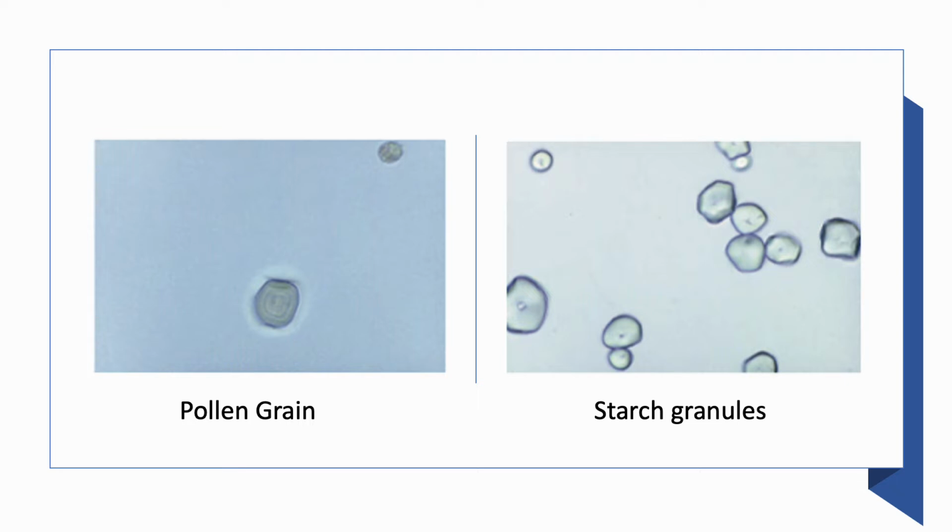So what we can do is use polarizing microscopy to be able to identify a Maltese cross from an actual fat droplet, or a red blood cell can be differentiated from these starch granules by considering other urinalysis results like the chemical test positivity for blood and protein, and also the presence of the oval fat bodies or fatty casts can differentiate these starch granules from the fat droplets.